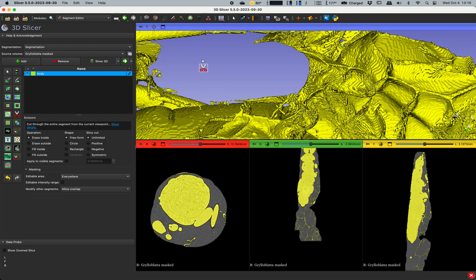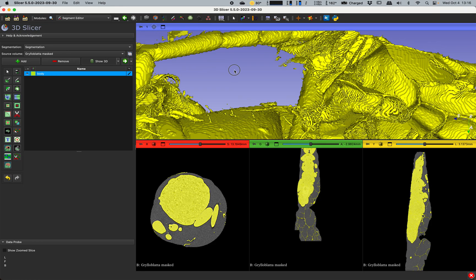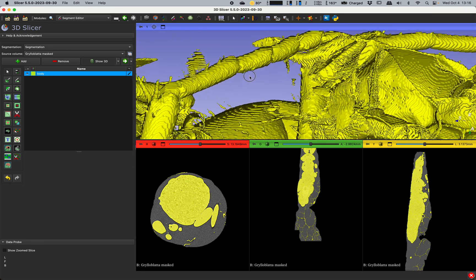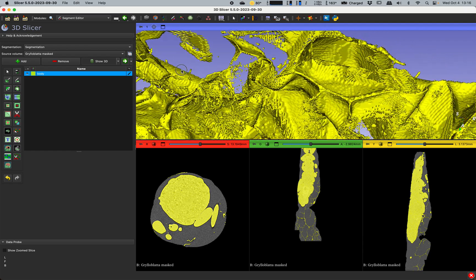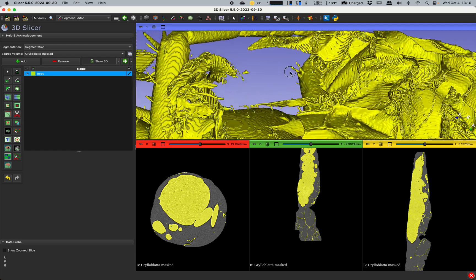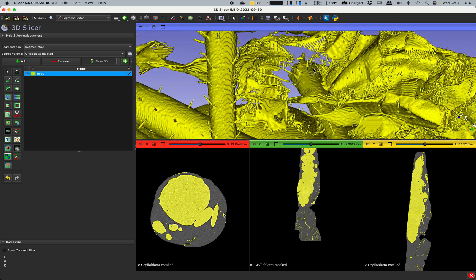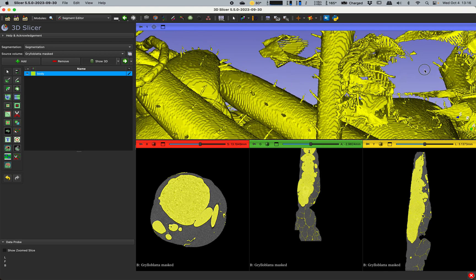Handy shortcut: space goes between switches between the last two used tools, and Z is useful, it's undo. And sometimes you can cut things away that you didn't really mean to cut away, so you have to back up and then go forward again.